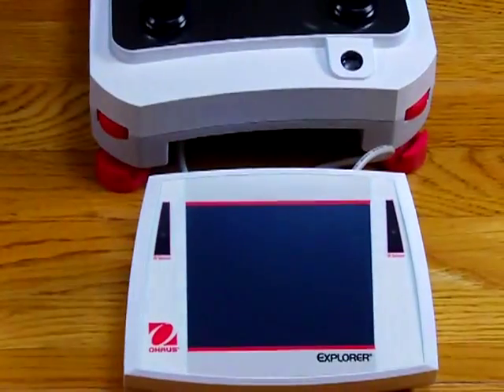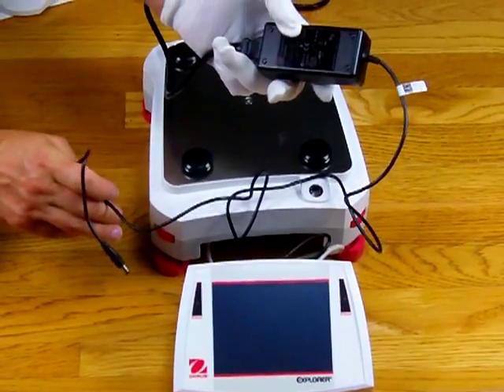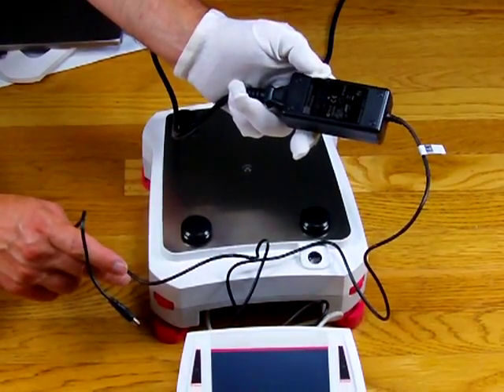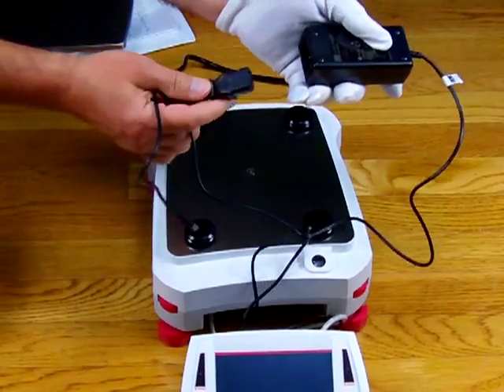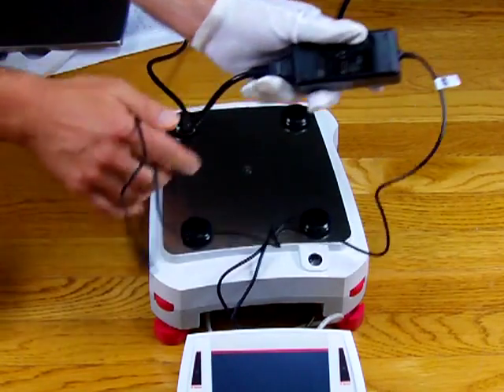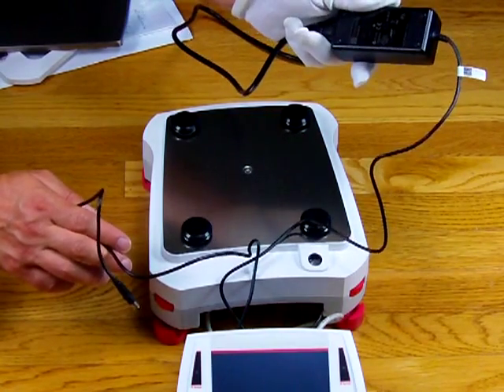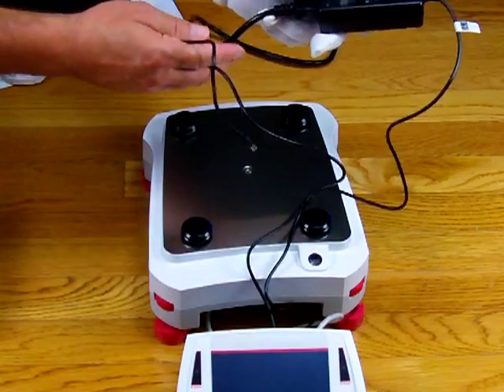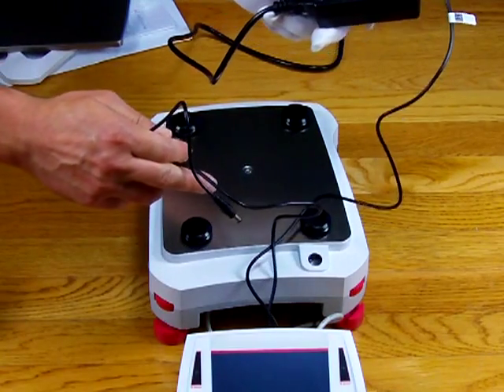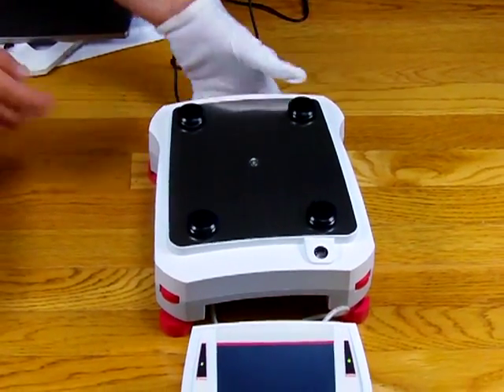Another nice feature is that these balances all come with universal power adapters. The adapter senses the incoming voltage, so all balances come standard with the 110 cord for the US. If going overseas, you simply change out the power cord to a 220 cord and the AC adapter automatically senses the incoming voltage and switches over. So you can use this adapter for 220 or 110 — the only difference is the power cord.